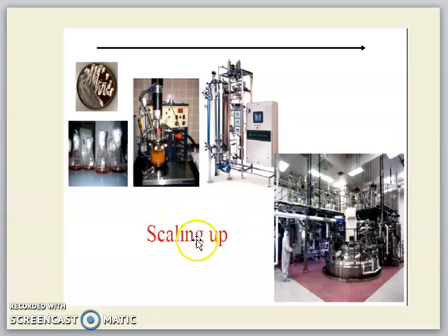This picture shows the scale up reactor. We know that in the microbiology area, we start with the plate study, the culture plate study. We have this bacteria on the plate. Then we have this shake flask.